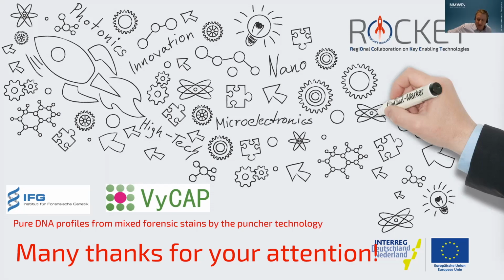Yeah, I would have another question. Have you also spent already some thoughts about how to pick up those single dead skin cells? I don't know the name, I can't remember it, but those you lose all the time. Yes, we have spent some ideas on that. The difference is they are not that soluble in water because they have a high lipid content, and therefore we think of adding some detergents to the solution to make them better solvable, or in a solution or in a suspension format.